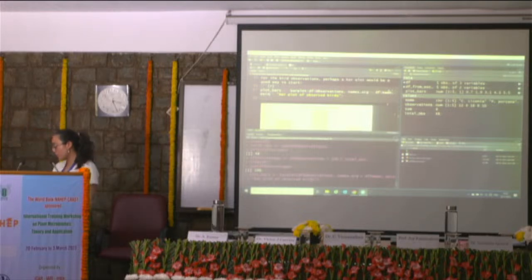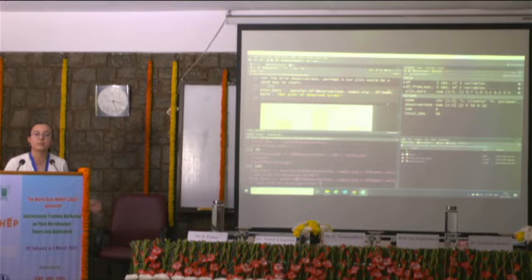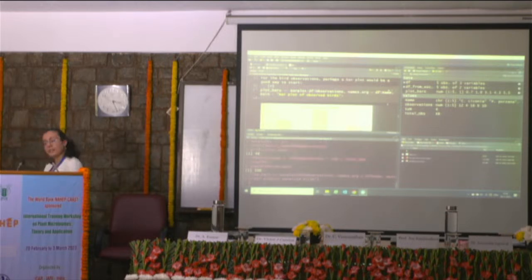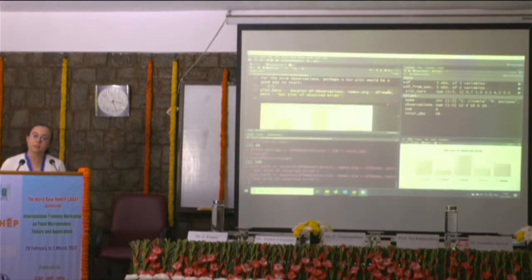But if you go to console, click on console to make sure that you're going to be there, and then go 1 time up with the arrow of your keyboard, and this saves the history. So you can access the command that you just did. You don't have to type it all over again. So I do it again. Like this, click on the console, then 1 up with the arrow. It shows you what you just run. So let's do enter. And now we get the bar plot in the plot panel.